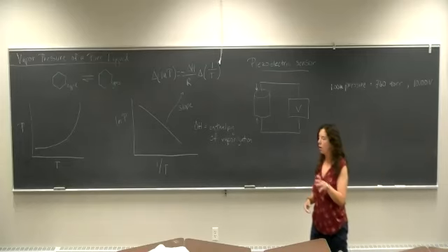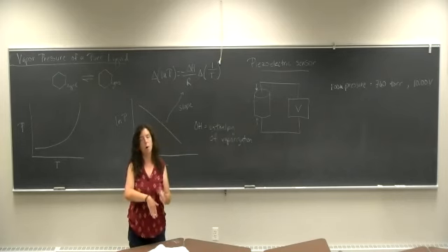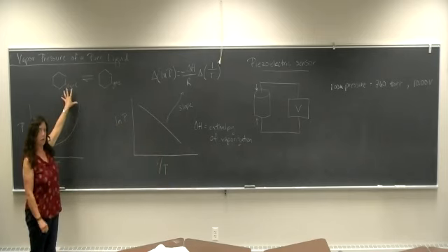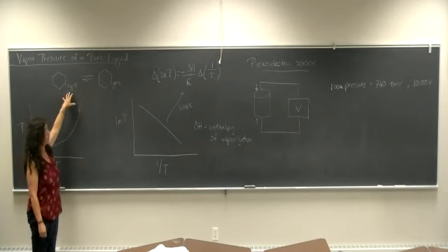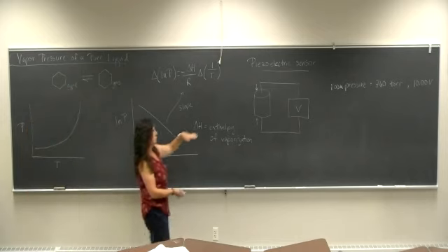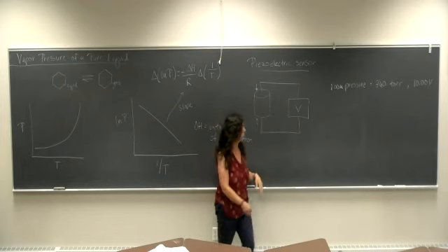And then to get our next measurement, we'll actually pump out all of the air that's in the vessel. So we'll actually end up freezing the cyclohexane so that we can pump out all of the air in there. So then when we start heating it up again, the only thing that's in the vessel is the cyclohexane and no additional air.